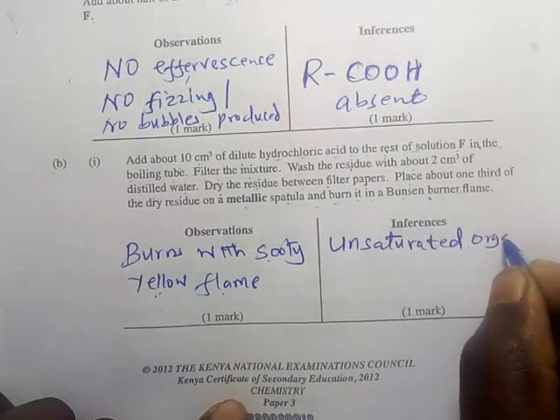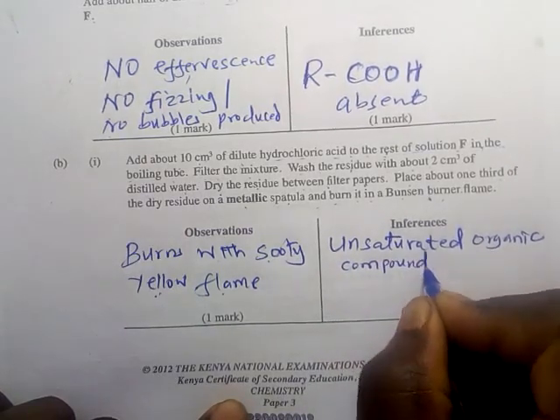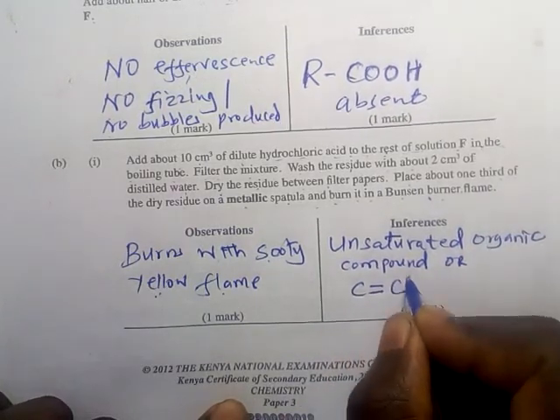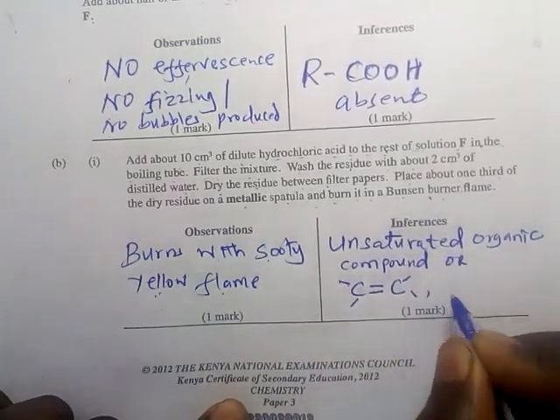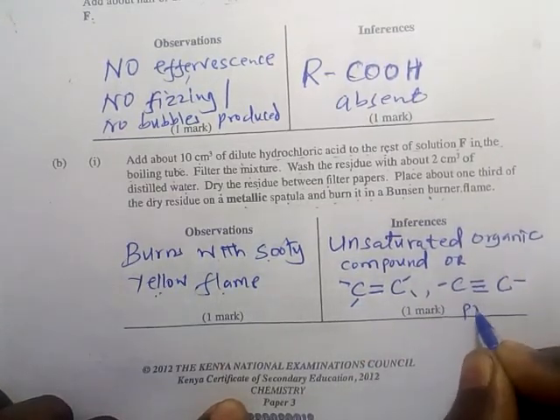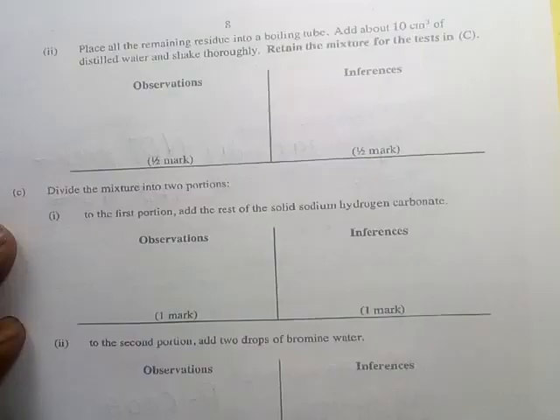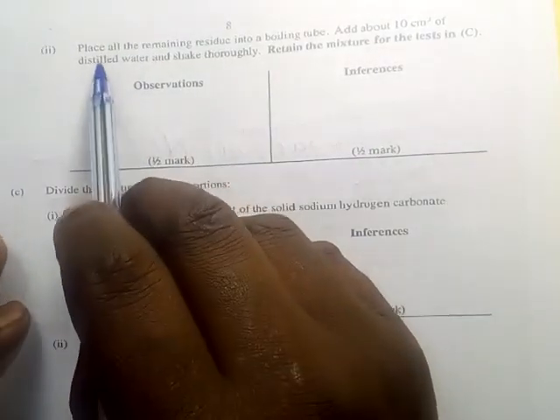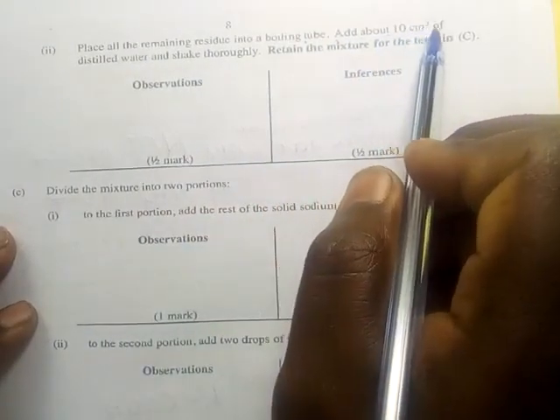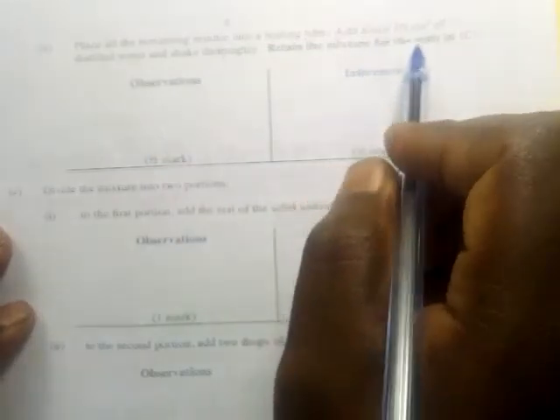Unsaturated organic compound. Or you write the double bond, triple bond present. Place all the remaining residue into a boiling tube. Add about 10 centimeters cube of distilled water and shake thoroughly. Retain the mixture for test in C.